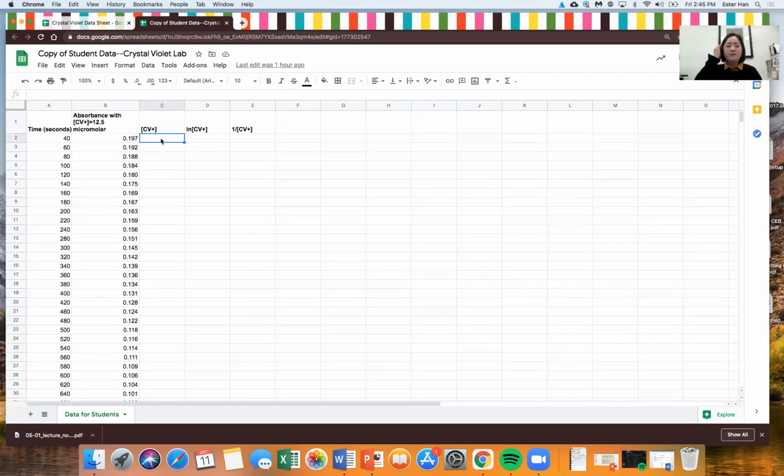So what you should probably look at right now is your lab sheet, where you wrote down the equation that you got last week on Thursday for the calibration curve. If you are looking at your equation, I think most of you should have had an equation like this, where y is equal to 0.0394x minus 0.022.